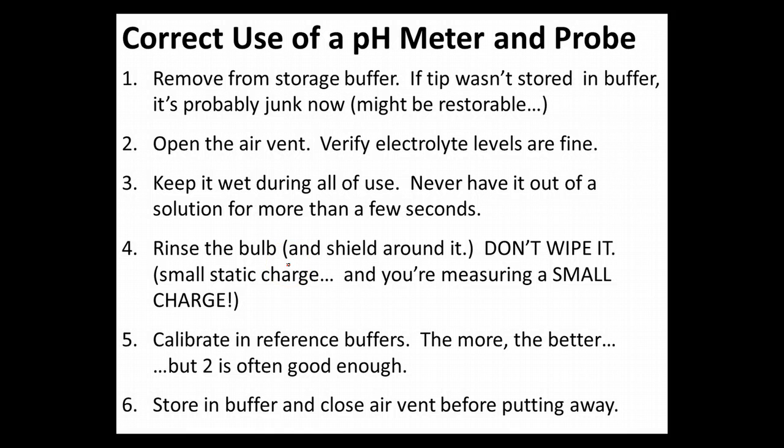pH meters seem like they're a really obvious and intuitive piece of equipment to use, which makes them ripe for misuse. I almost always see people misuse them, so I really want us to make sure we know how to correctly use a pH meter, and especially its pH probe, because we're actually doing a sensitive electrochemical measurement that's very easy to disrupt.